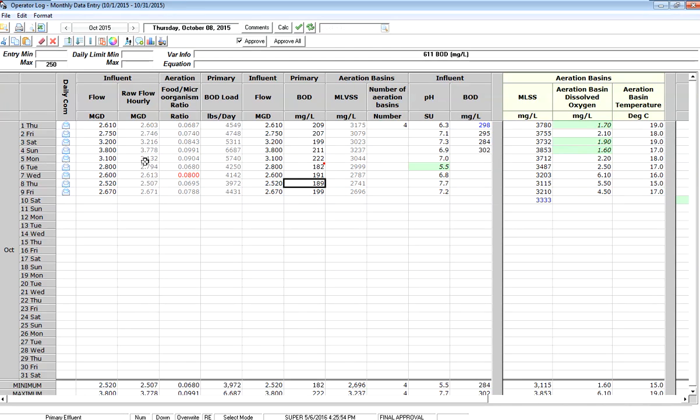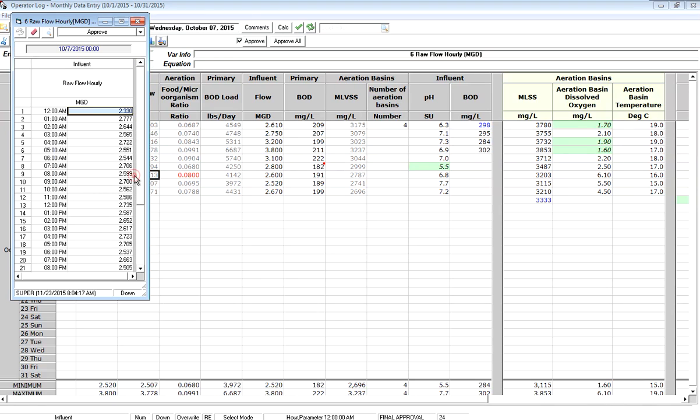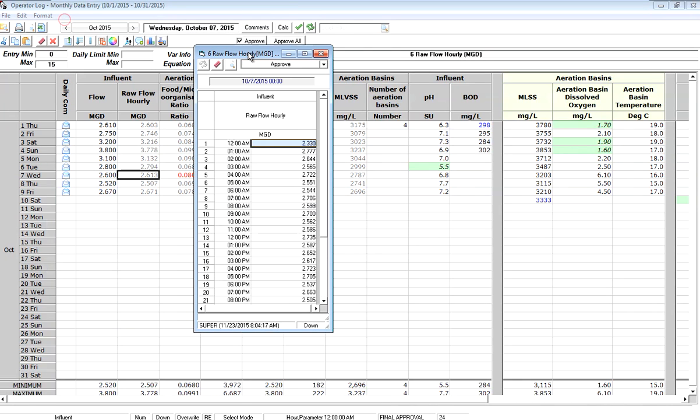I can also drill down into daily detail variables. So here we have a variable raw flow hourly and what it does is it's showing me the average for my hourly entries. I enter it each hour. I have 24 entries for the day. If I double-click on this cell, it will pop up and allow me to see all the raw numbers that go up to make the average for the day of 2.613.